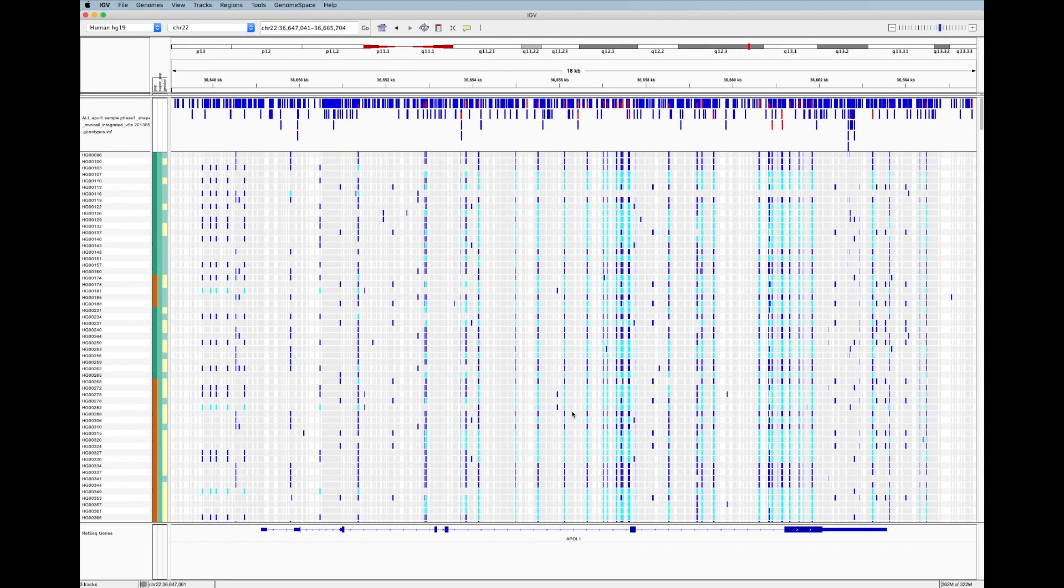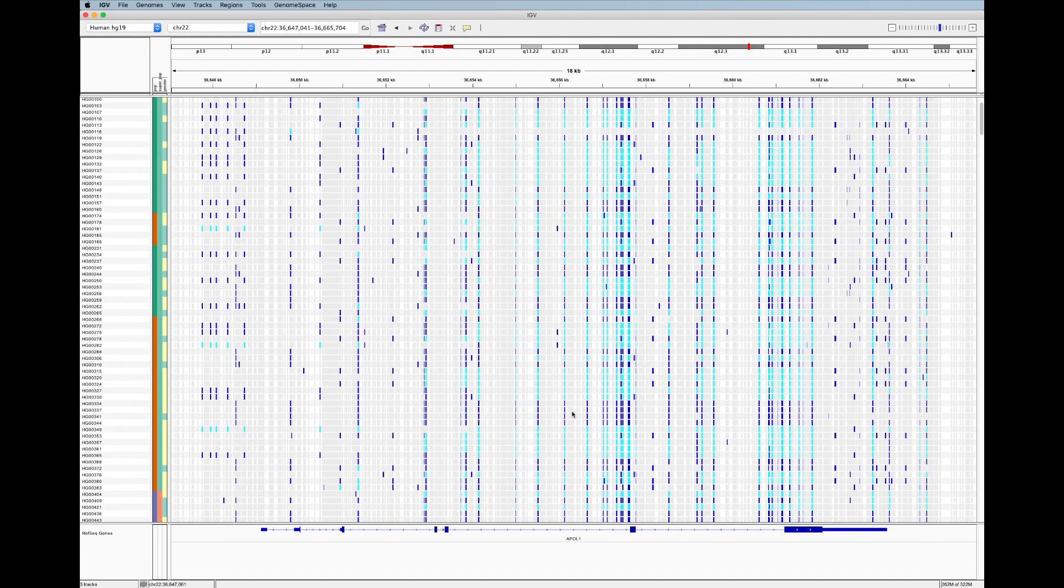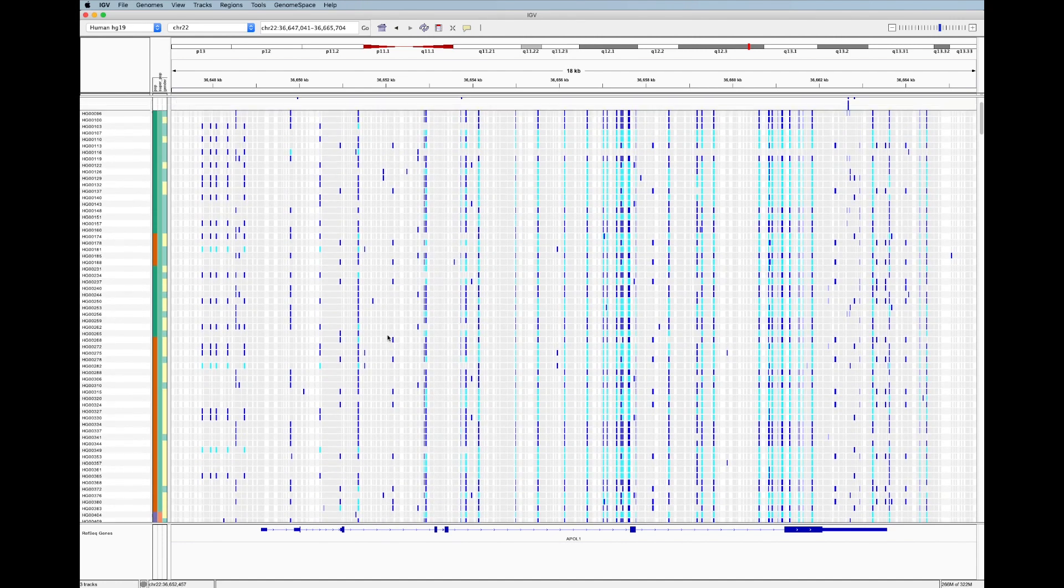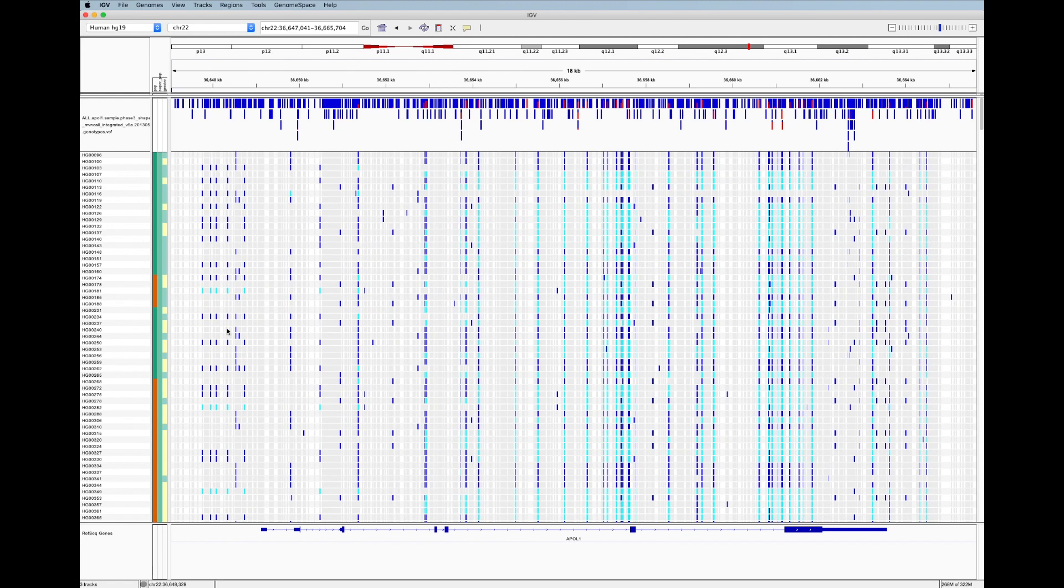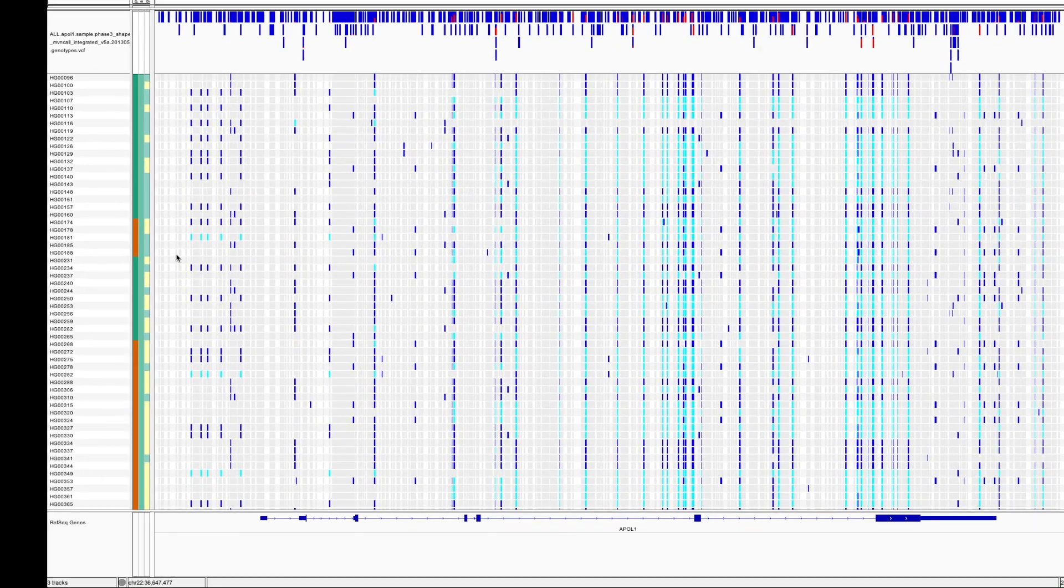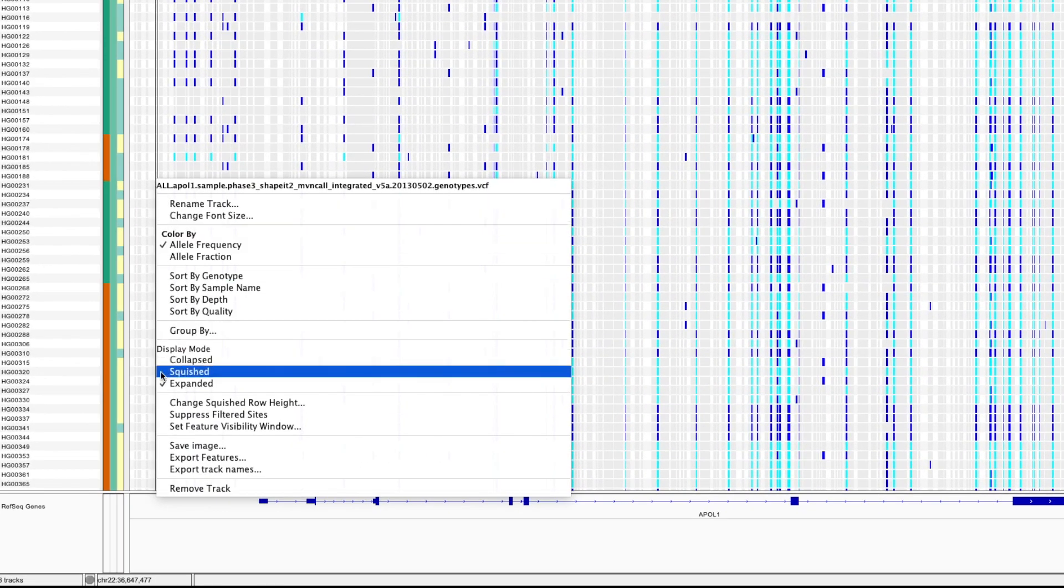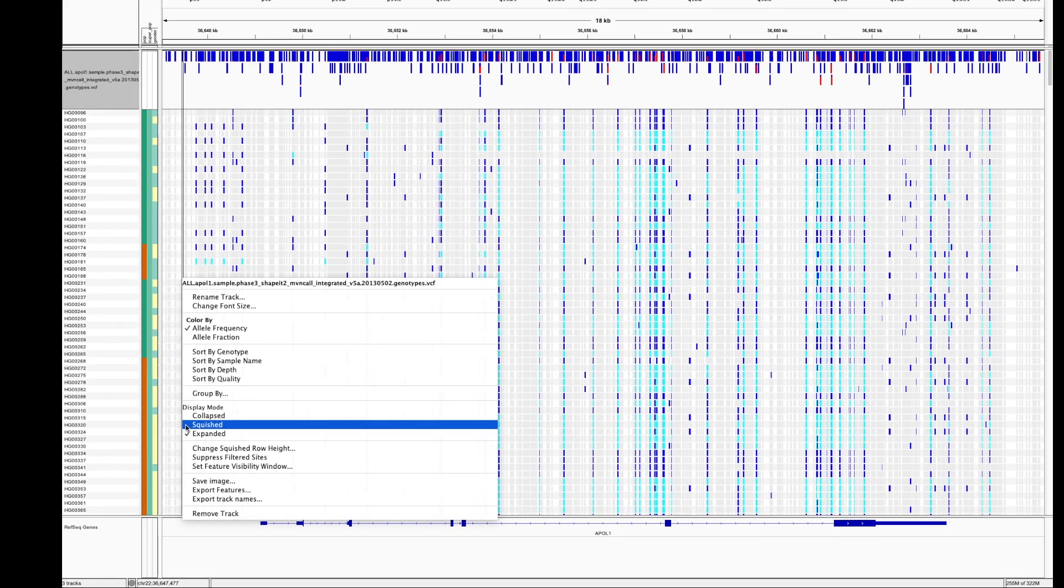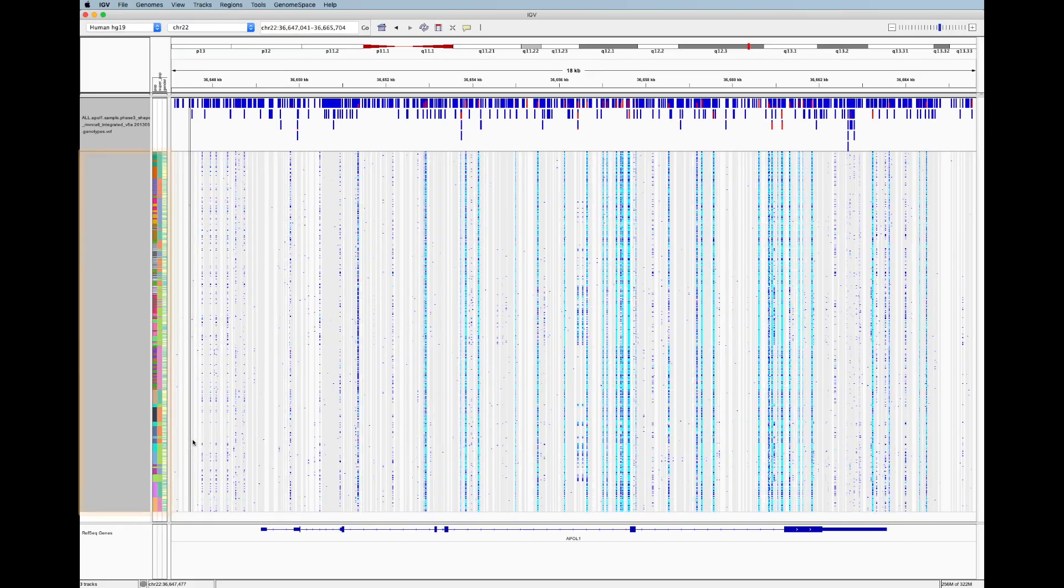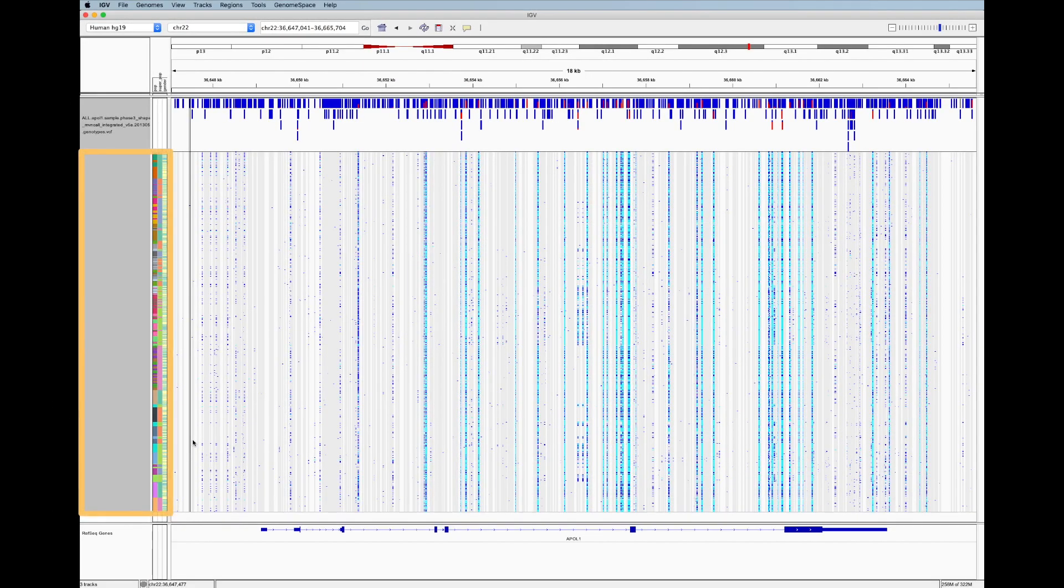So now that we see the sample annotations we want, we can start looking for patterns. But to do that, we need to be able to see all of our samples. We can do this by right clicking and setting the display mode to squished. Now we see all of our 850 samples.